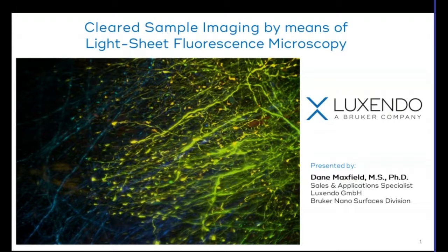Maximum magnification and resolution? Maximum magnification at the moment is 30x with a 1.5 mag changer on there, and then that will be upgradable to a 40x total mag as well.